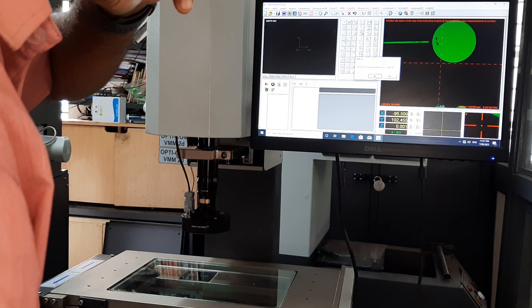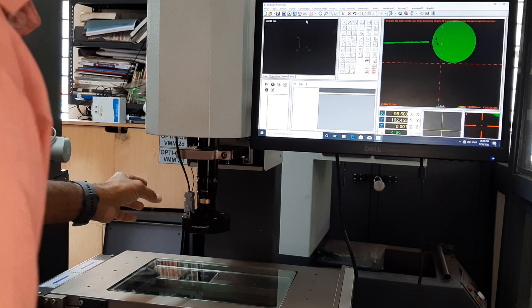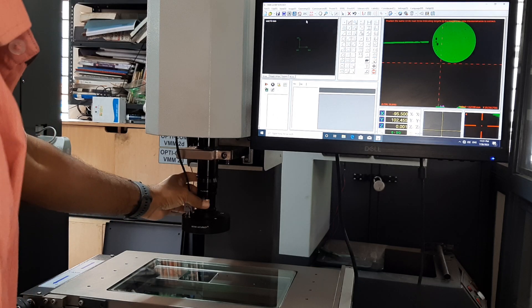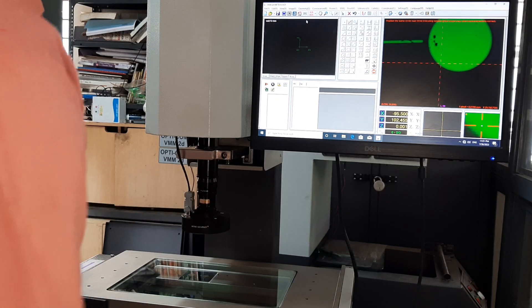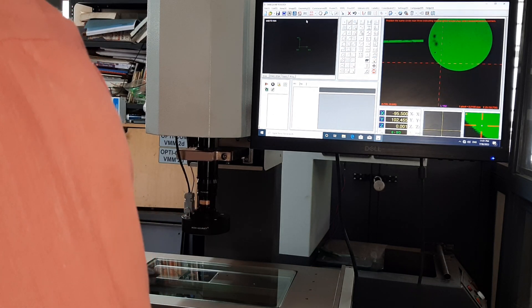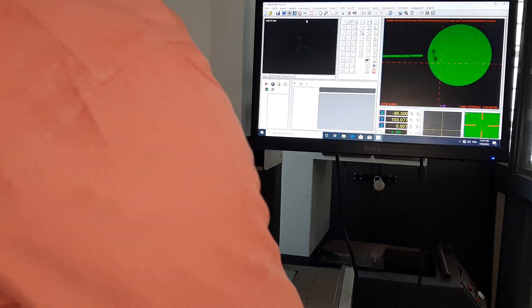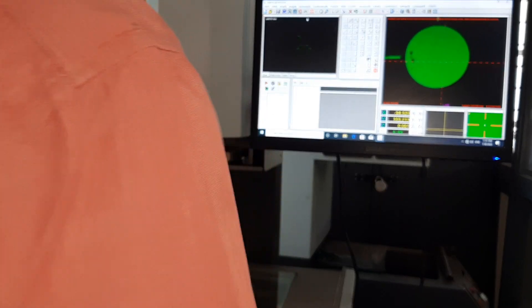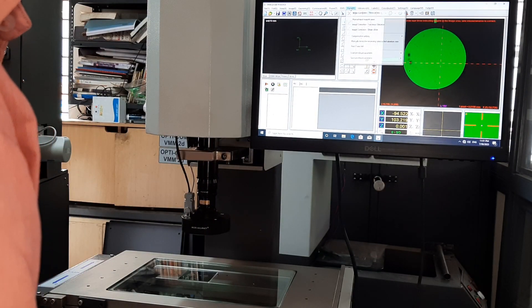Same, select 1. Focus. Now you go to again proof.